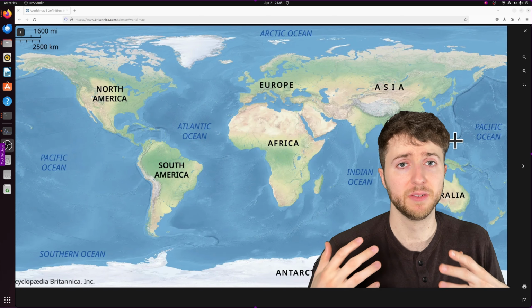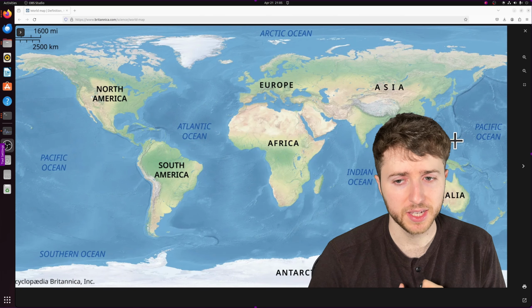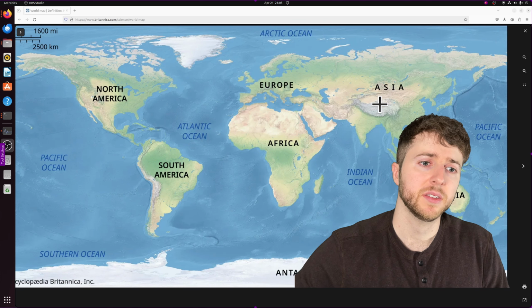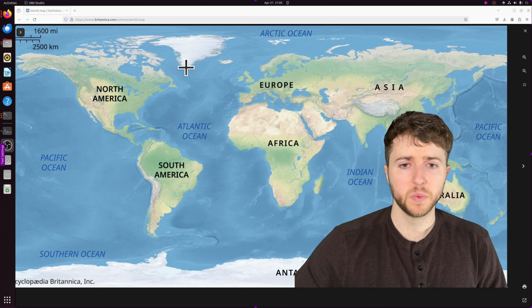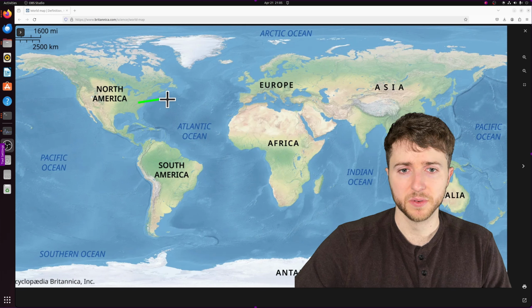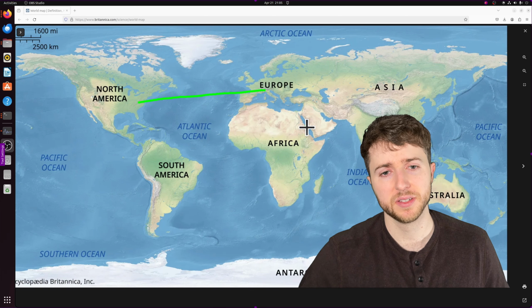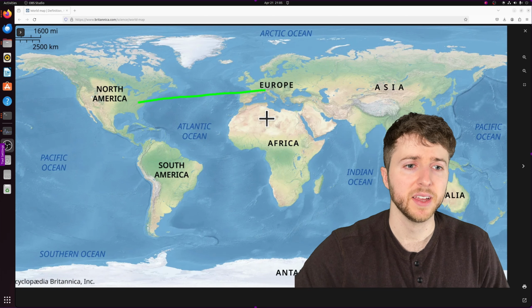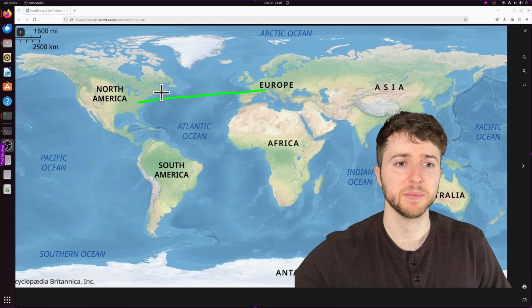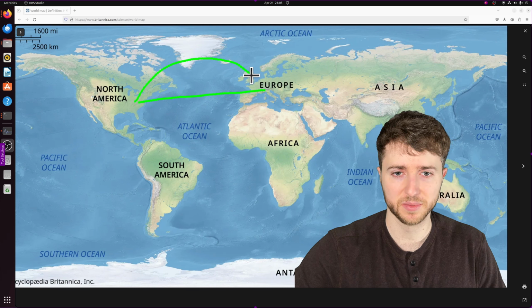Okay, so before I even run UMAP, I want to point out a couple things. Some people do use UMAPs inappropriately. I'll just quickly use this analogy to explain what the issue is. So think of the distance between 2 points on a map. Let's say you're flying between, I don't know, somewhere in North America to Europe. You would think, looking at a map, that the shortest distance would be this straight line, right? But this map actually represents a sphere, the world isn't flat like some people might believe. So the actual shortest distance between these 2 points is something like this.